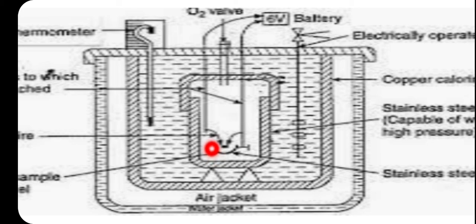Now in this, as you can see, there is first of all this tube, and this is a crucible, and in this crucible the substance is put. Now the bomb calorimeter is used in case of solids and liquids. So whatever is the fuel, it is first weighed and put inside this tube. Then this substance is connected by these two wires. These two are magnesium wires, and these two magnesium wires are then connected to two electrodes. Both these electrodes are further connected to a 6-volt battery.